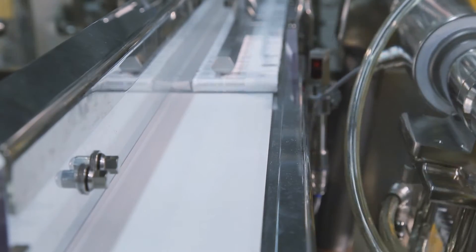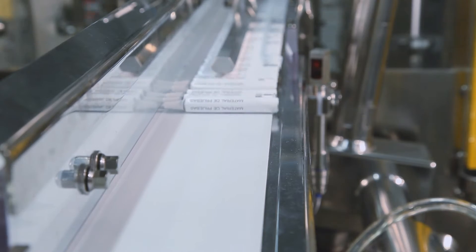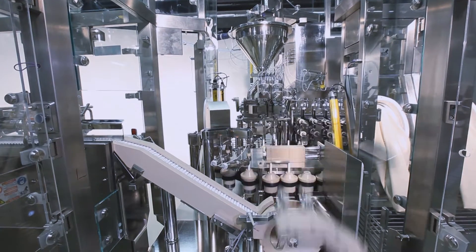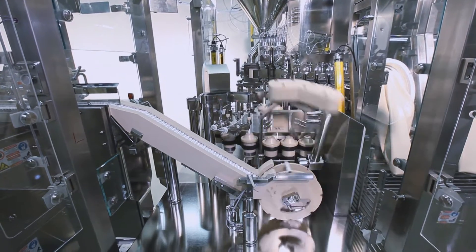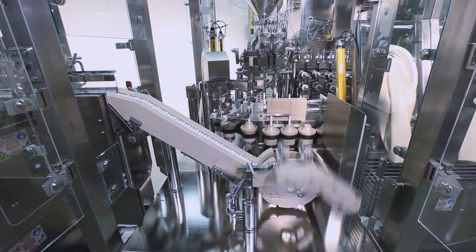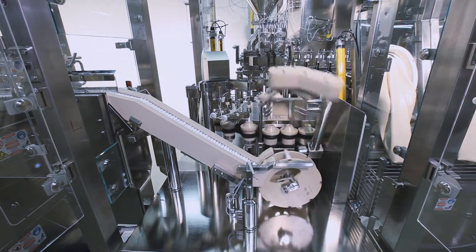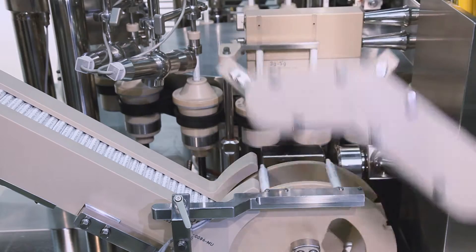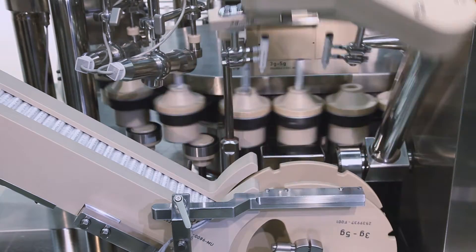The tube infeed conveyor is designed for easy cleaning and can also be replaced within a few minutes if necessary. The tube infeed device which places the tubes into the tube holders is based on the proven FP series design. Nevertheless, the whole section was redesigned to comply with the hygienic requirements in a sterile environment.